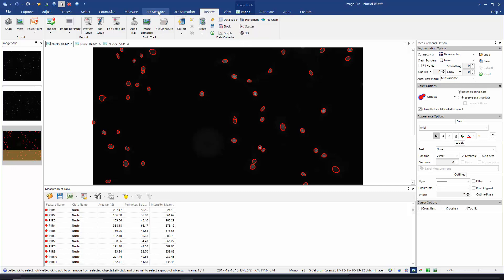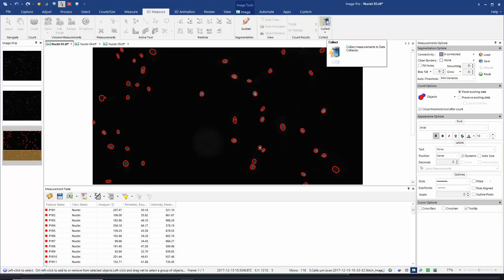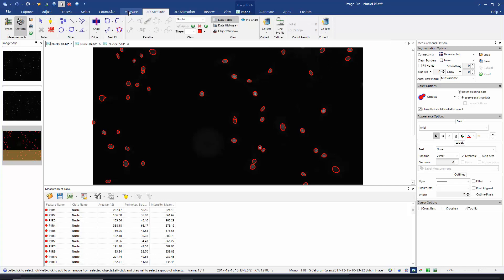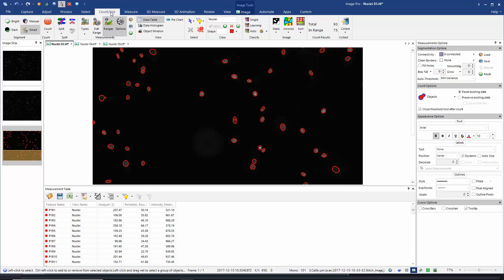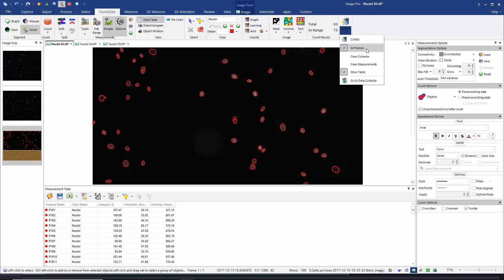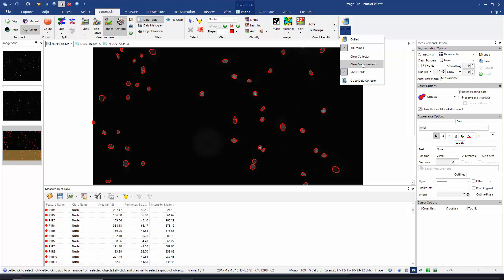Now that the data collector table is correctly configured, we can proceed to make some collections from our images. You'll notice there are various locations throughout the software where you'll see the option to collect data. For example, in the 3D measure tab we have an option to collect, and in the measure tab we can collect, and also in the count size tab — which I'm currently working with — I see the option to collect. For each of these collection options there's a dropdown which allows us to configure the collection: collect from all frames, clear the collector every time you hit collect, clear measurements, and show the data collector table. Clicking 'go to data collector' takes you back to the review tab where the data collector is configured.